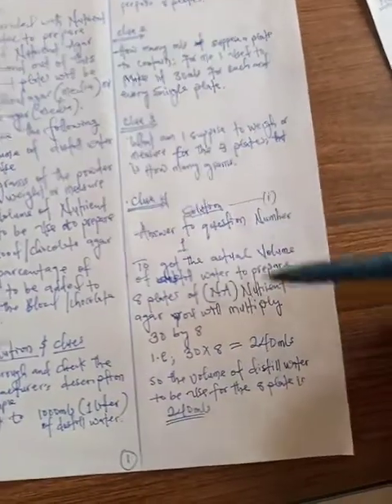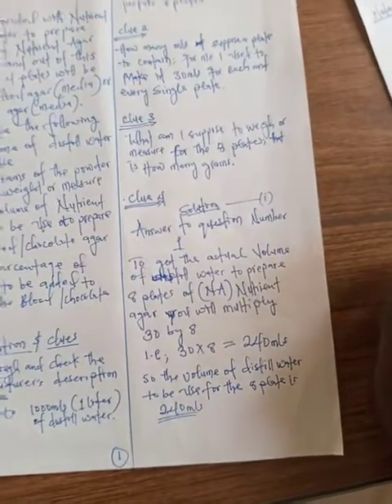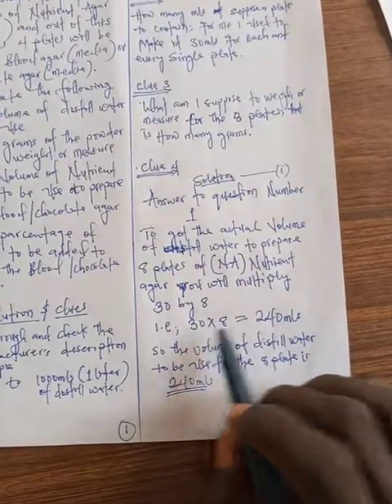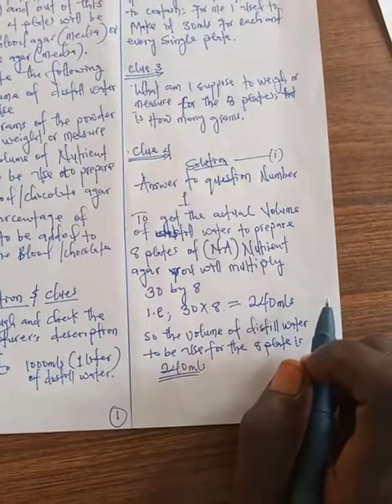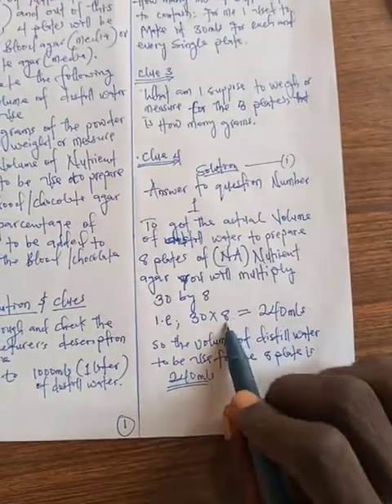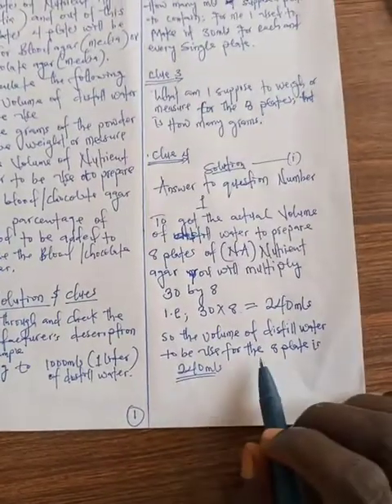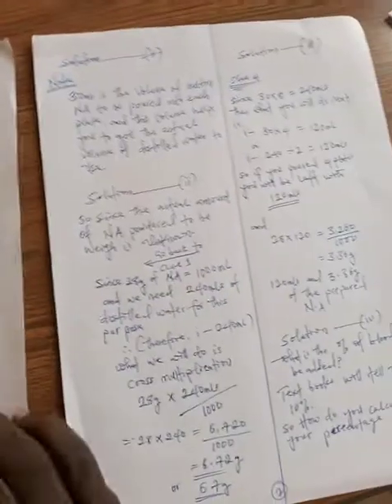So now solution number 1, that is to get the actual volume of distilled water to prepare 8 plates of nutrient agar, that is NA. You will multiply 30 by 8. If you multiply 30 by 8, you will have 240 mls of distilled water. So 240 mls will be used for these 8 plates. So the volume of distilled water to be used for the 8 plates is 240 mls.